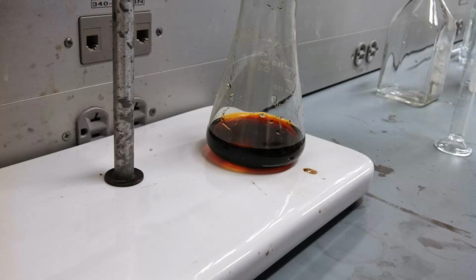Once you add that to the titration flask and dissolve it, you're going to add sulfuric acid, 1 to 4 diluted with water. And when that happens, you're going to form the triiodide ion, which has the dark yellow color seen here. It actually looks more brownish red because there's a large amount of it in this flask. This is what you're going to titrate away, and the absence of this is going to indicate your endpoint.